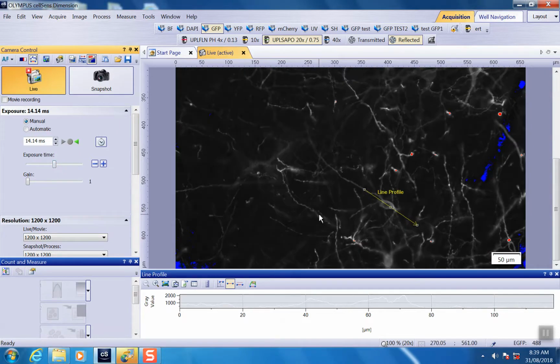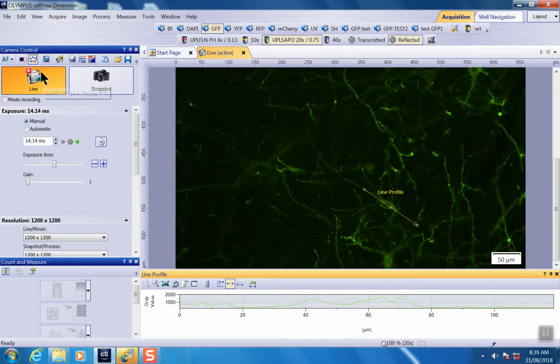But if you go too low, you see the blue area. That's where it's below the lowest value we can detect. Then again, it's just black. We can untick that one.